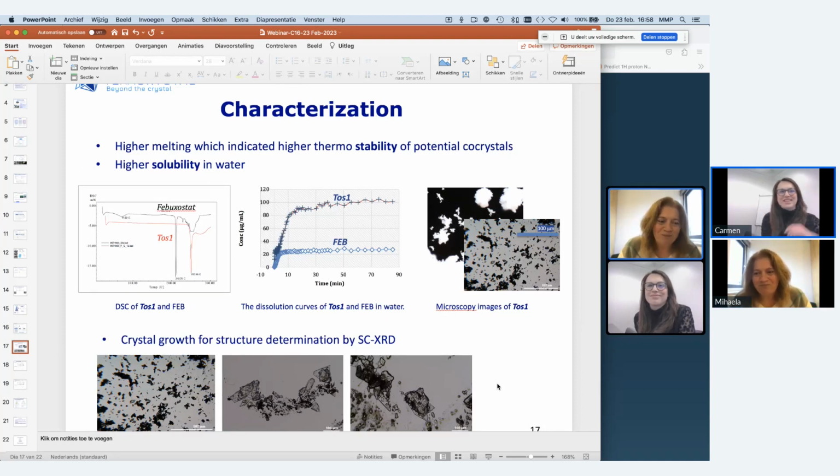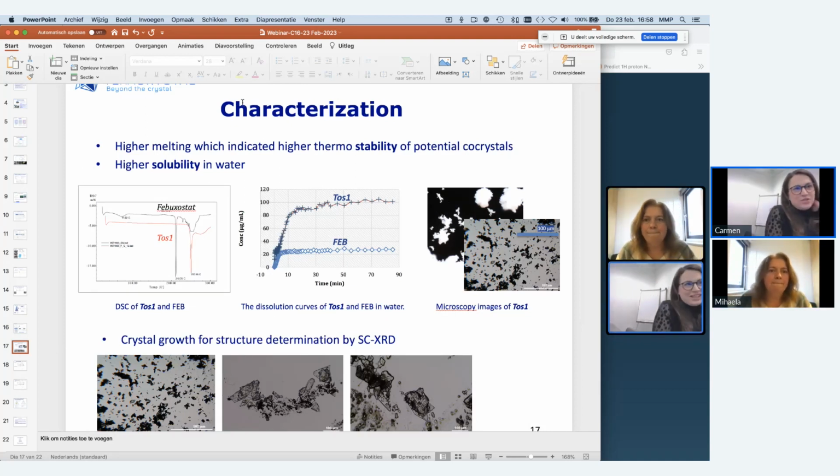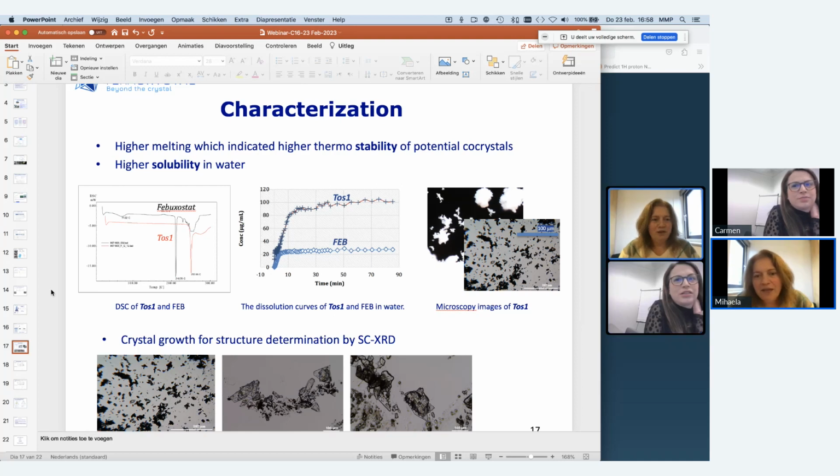Nice, beautiful. The solubility values at 5 degrees, are they experimentally measured, for example in the second and third cycle, or extrapolated using the fitting equation? Very good question. Thank you, Thomas. With a new software, which I didn't use, I have to say, he extrapolated for 5 degrees.